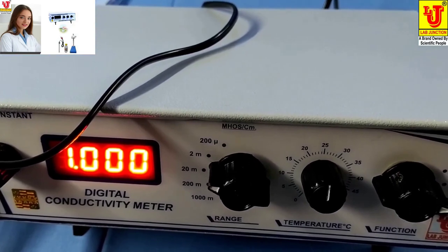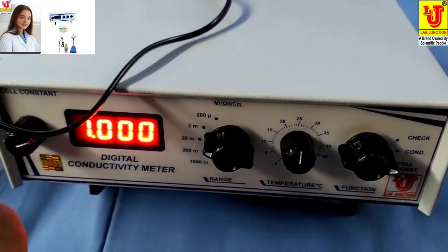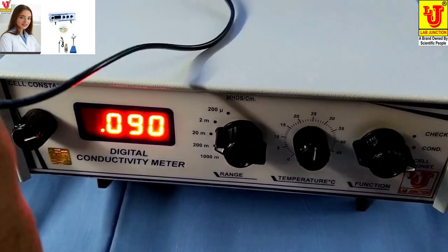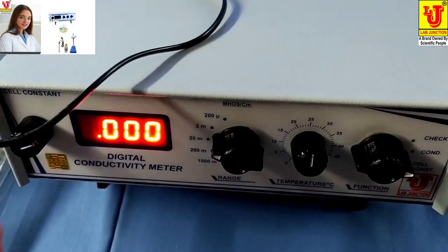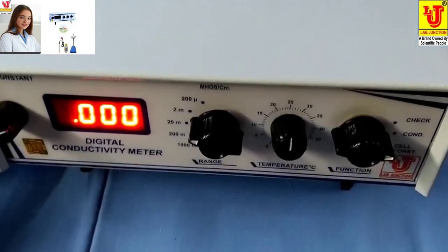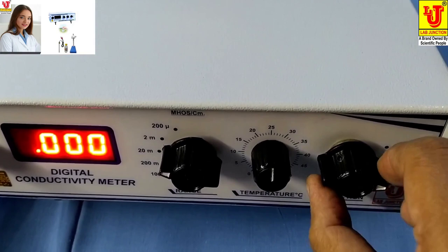Now your Digital Conductivity Meter is calibrated and it is ready for use. One parameter is left, that is cell constant.